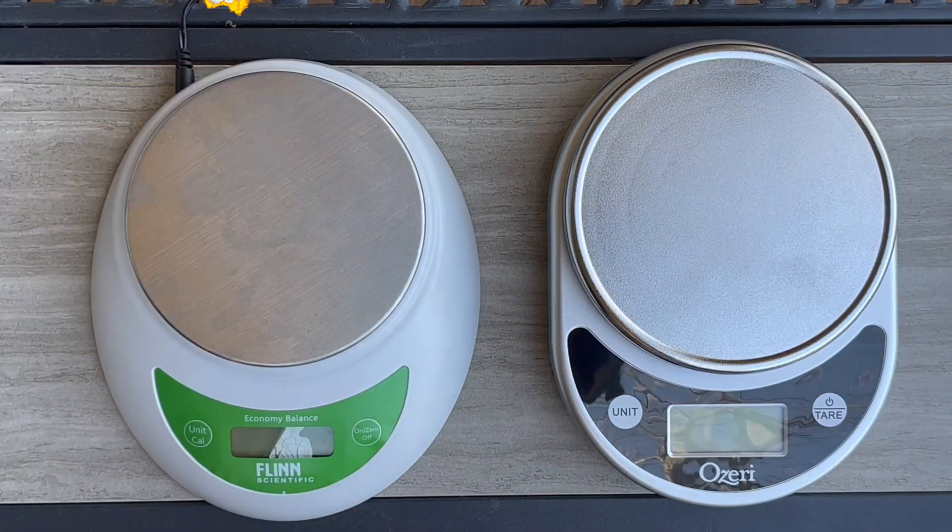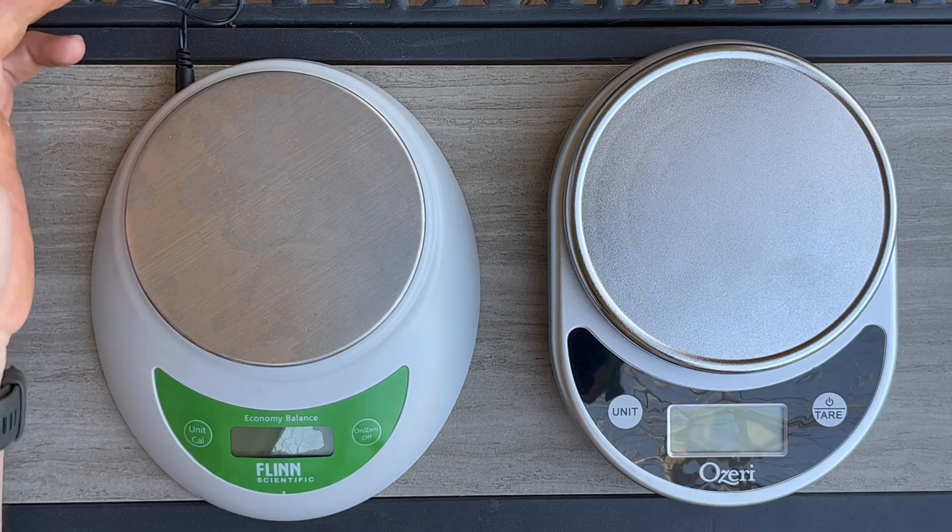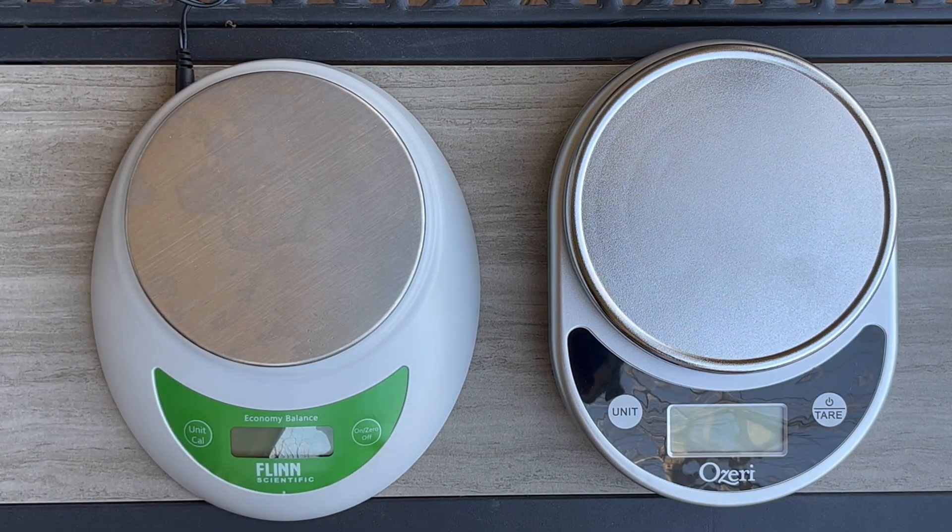Okay, so maybe some basic instructions would be helpful. I have two different varieties of the digital scale here: the Flinn Scientific economy balance, which is plug-in, and a battery-powered Ozeri balance I bought on Amazon for about ten dollars. So what does this instrument actually do? It's used to measure weight or mass.